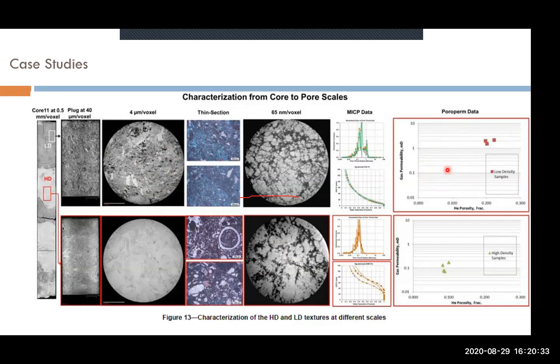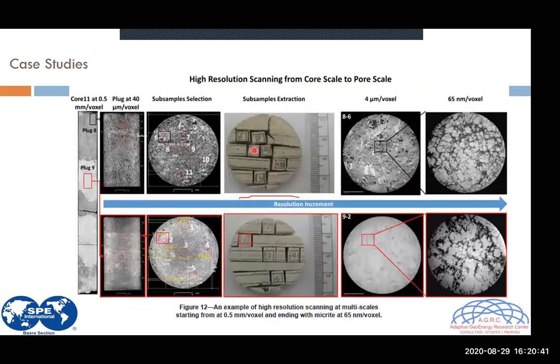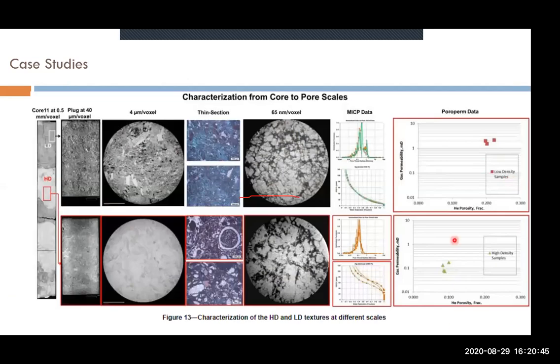analysis as well for each one of these smaller volumes. So just like you can perform several simulations from these smaller volumes, and then plot this kind of trends respecting the size of the sample that you have for this specific voxel size and the specific resolution, and then you can do the same evaluation in the next resolution. Okay, it's like an analysis with trends.